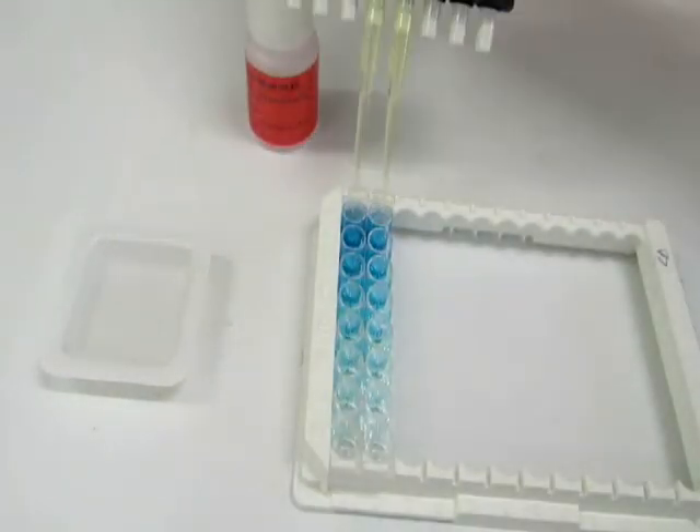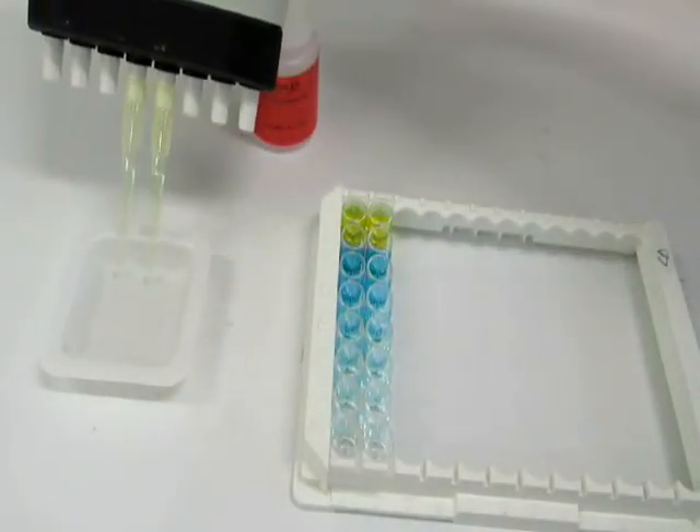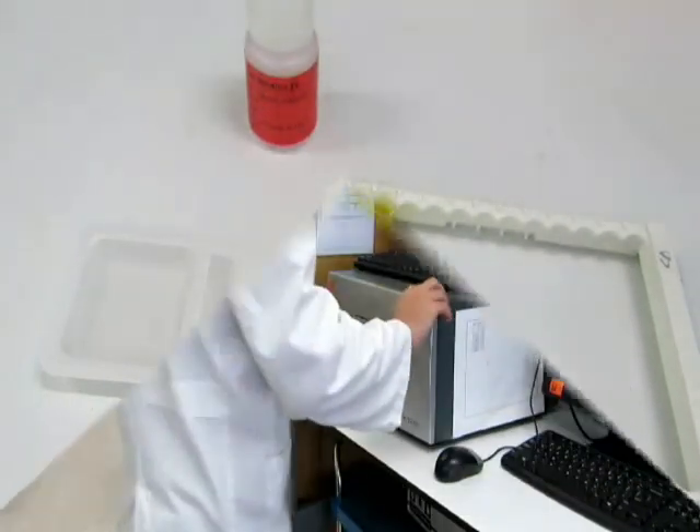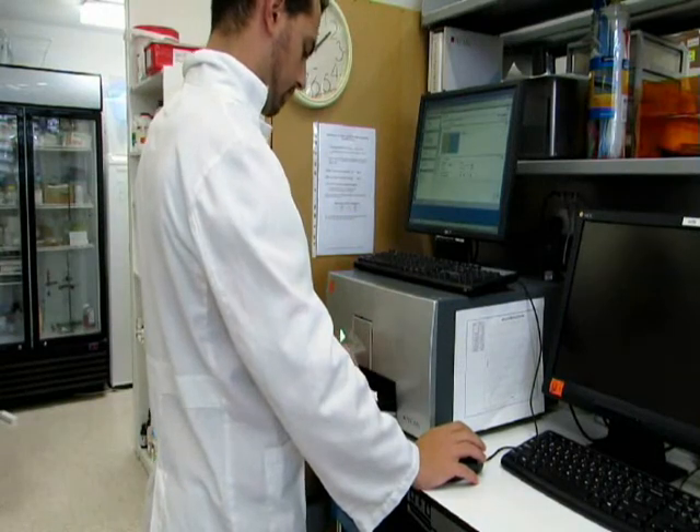Add 100 microliters of stop solution to each well. You will notice the color changing from blue to yellow. Read the absorbance of the wells with a microplate reader.